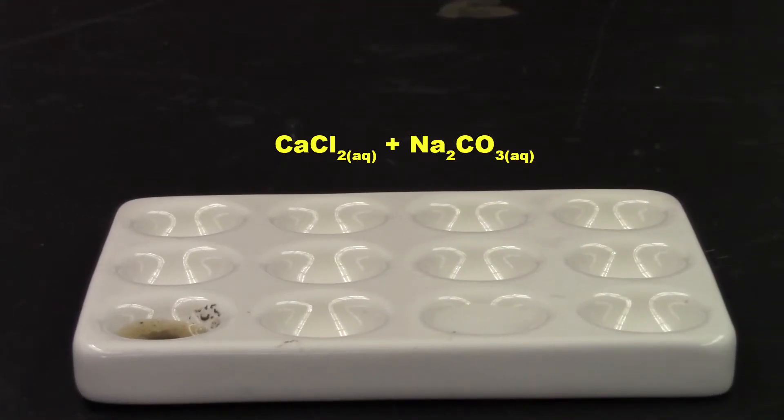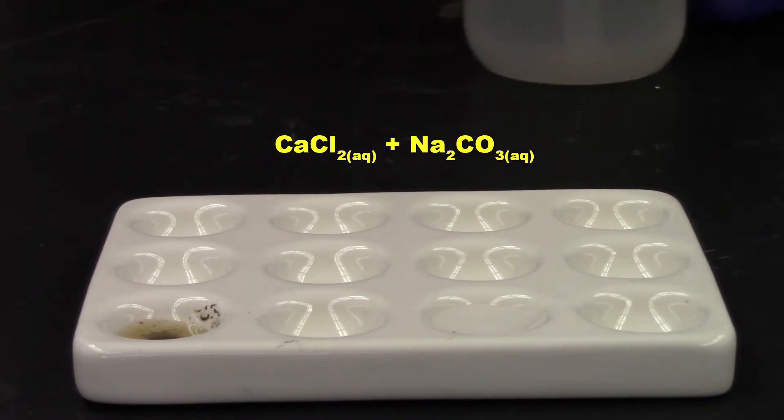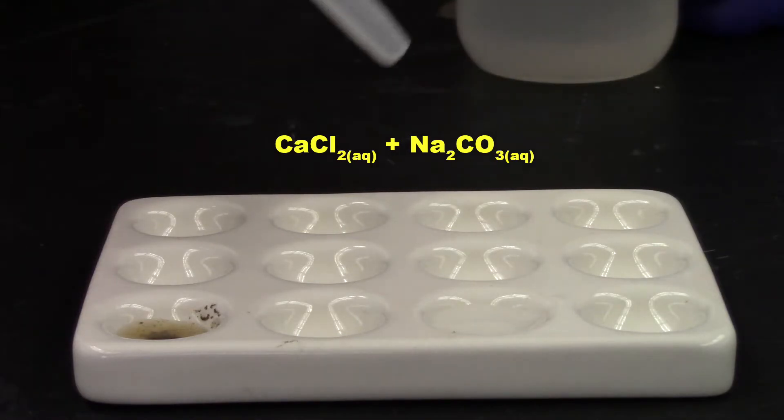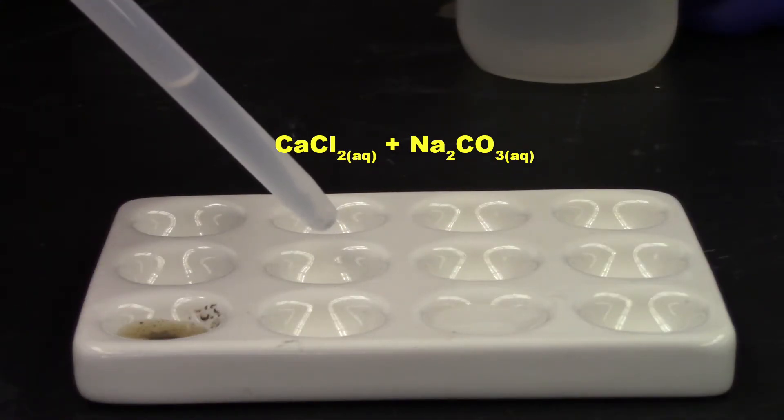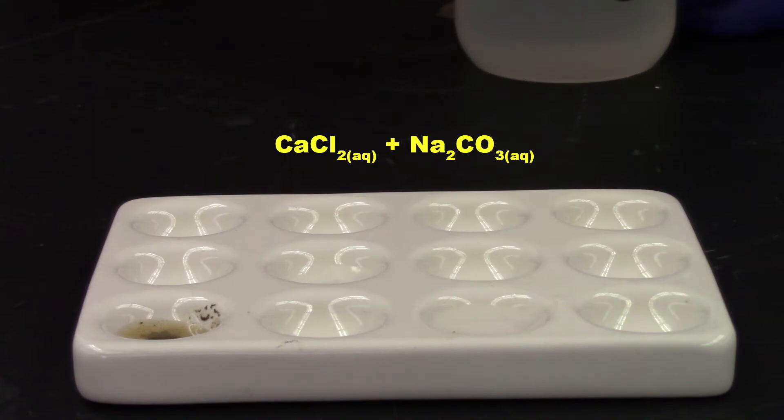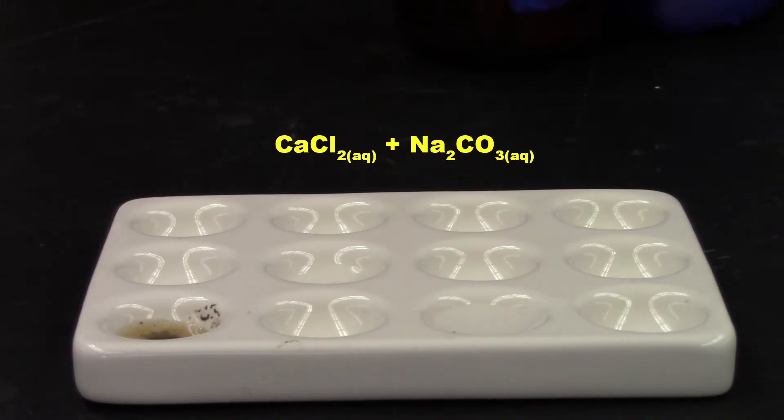Calcium chloride with sodium carbonate. Let's go to this well right here. One, two, three, four, five. Calcium chloride and sodium carbonate. Here we go. Here's the sodium carbonate. Again, clear, colorless solutions.